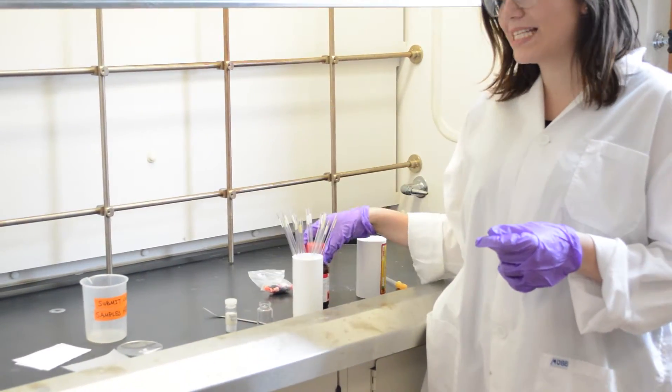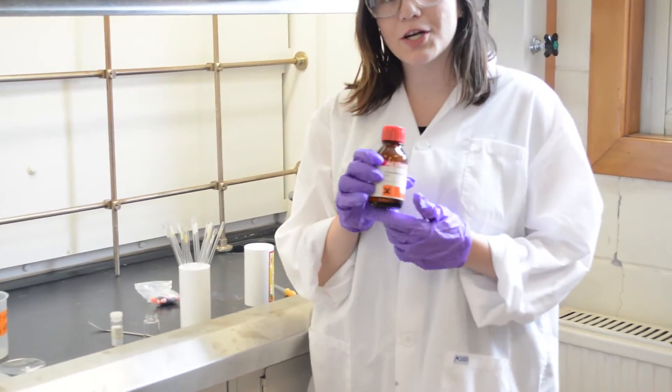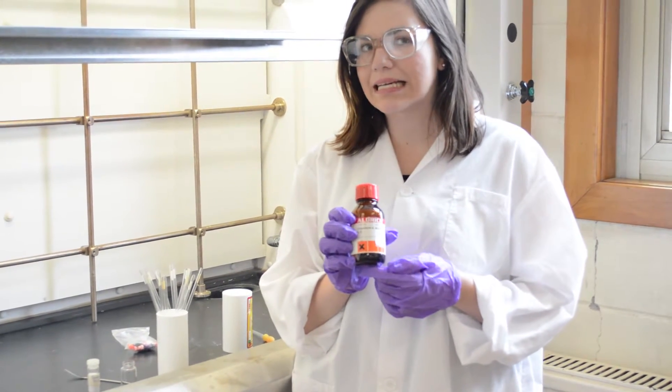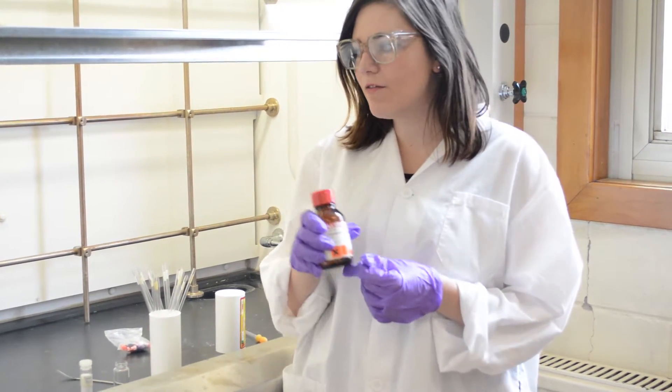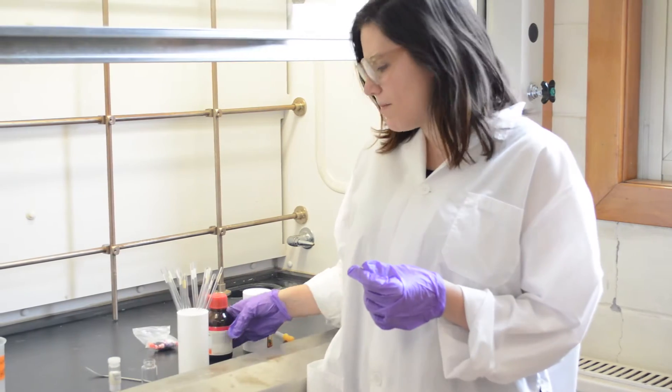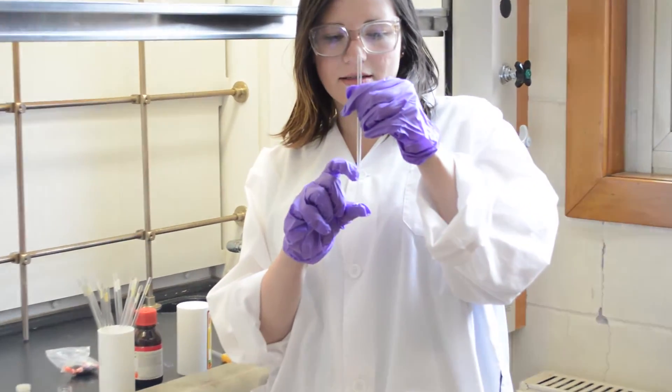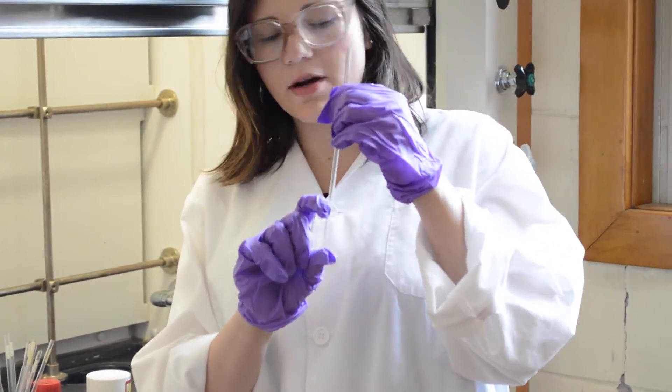Another important thing is the deuterated solvent, of which you're going to use about 0.6 to 1 milliliter. The sample depth is about 4 to 5 centimeters from the bottom of the NMR tube.